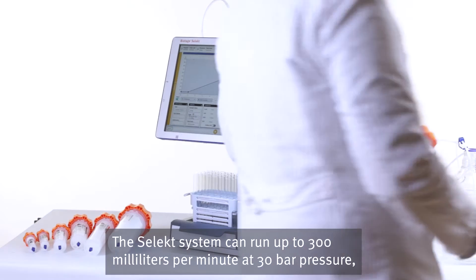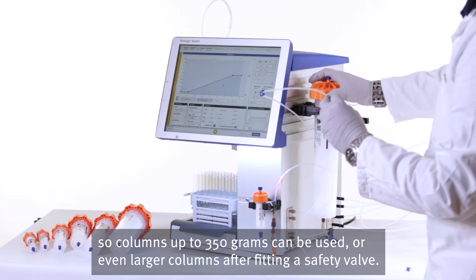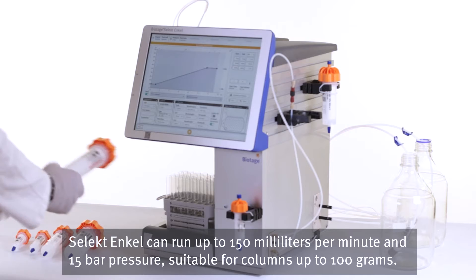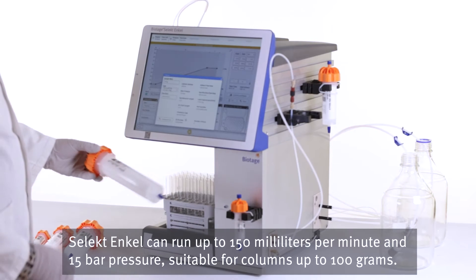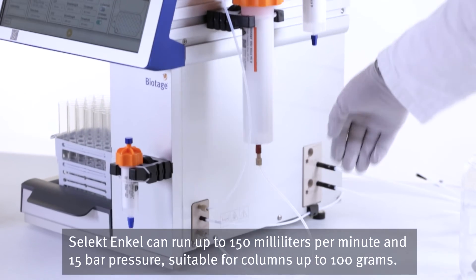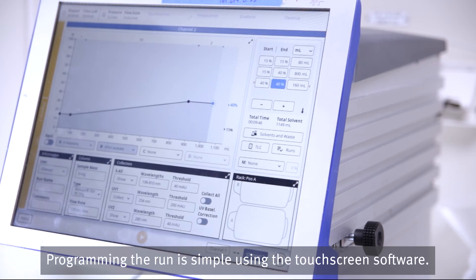The Selekt system can run up to 300 milliliters per minute at 30 bar pressure, so columns up to 350 grams can be used, or even larger columns after fitting a safety valve. Selekt Enkel can run up to 150 milliliters per minute and 15 bar pressure, suitable for columns up to 100 grams. Programming the run is simple using the touch screen software.